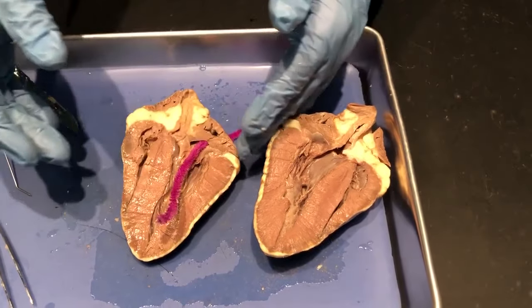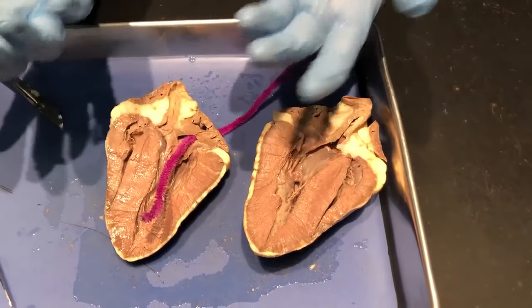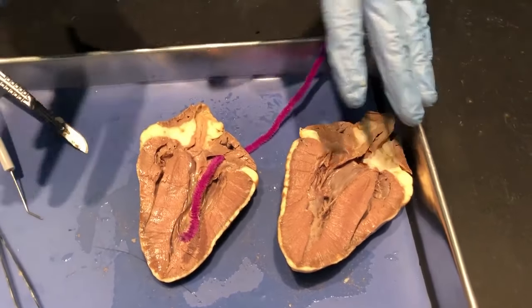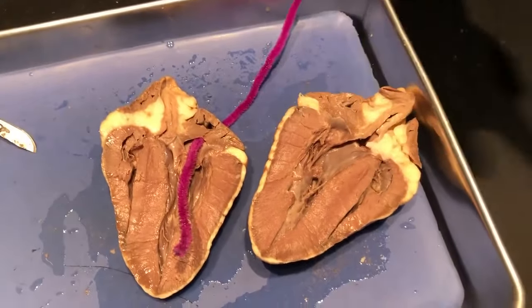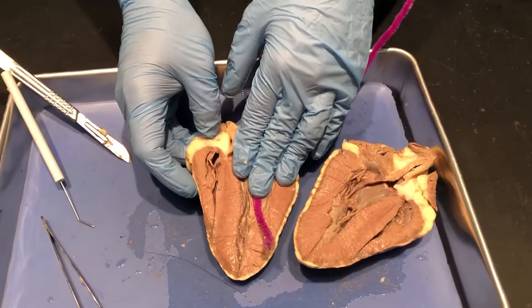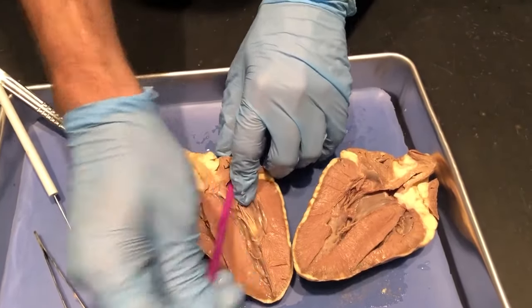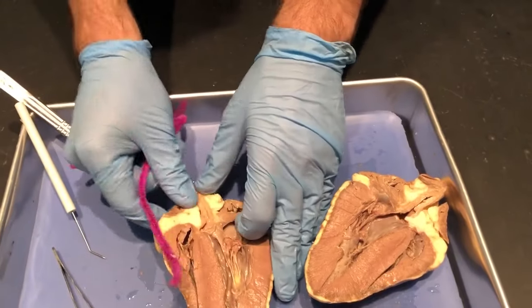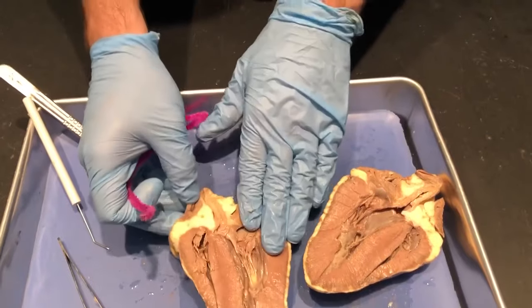From the ventricle, blood goes out to the pulmonary arteries, which then go to the lungs, which allow the blood to get oxygenated — because oxygen is one of the main reasons we have a heart; it helps move oxygen around the body so we can use it as fuel. From the lungs it goes to the pulmonary veins into the left atrium, which is this one over here.